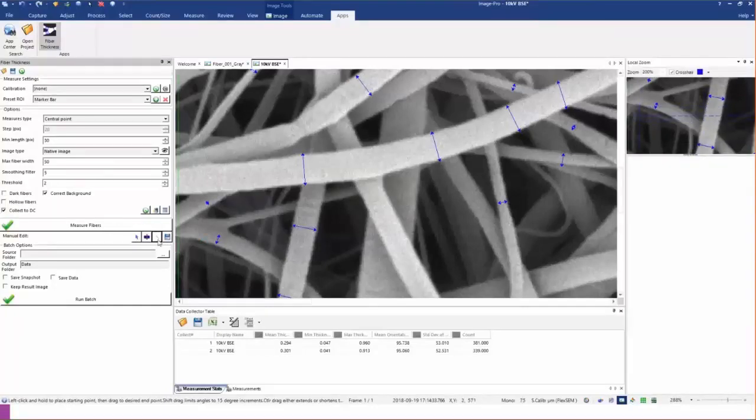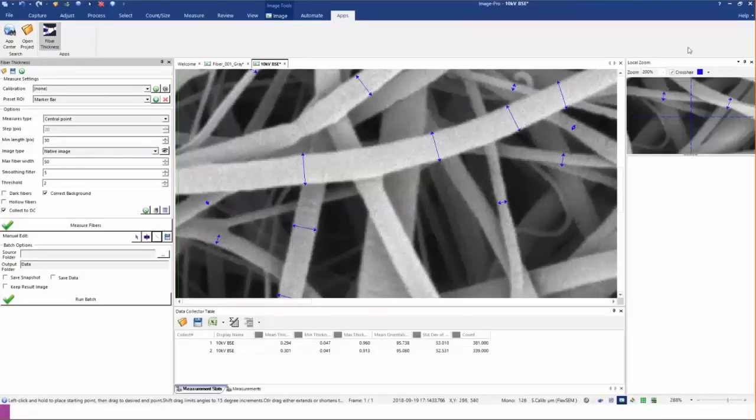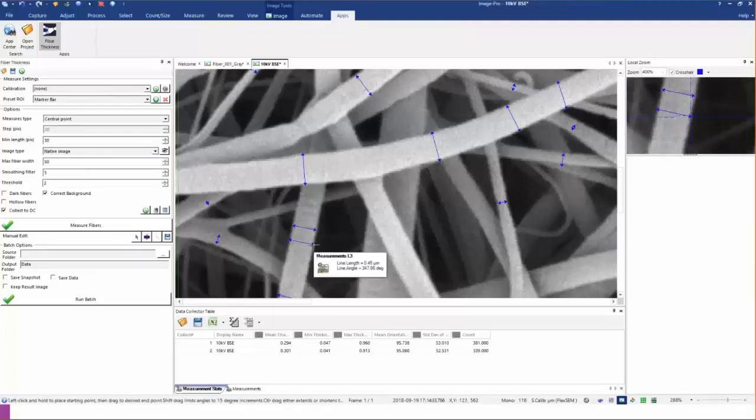The third option is the manual measurement line tool. Again, seeing the local zoom on the right, I can always come in or I can set this to a higher zoom, whatever is appropriate, and then come in and simply go across and measure. So again, this is an organized workflow. It'll speed up the analysis.